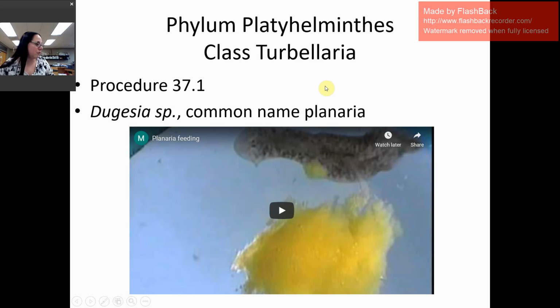Okay, so in the manual, they tell you procedure 37.1, observe a planarian. Since you're not here, you won't be able to look at the ones that we have here, but I'm going to play a video. And before I play it, I want you to look for a few things in that video. You will see the flatworm, which is located right here on the top of the video, and you can see its head.